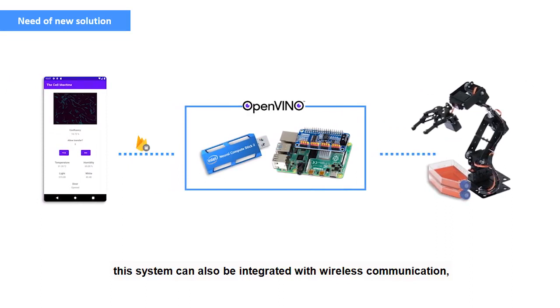Furthermore, these systems can also be integrated with wireless communication, allowing end users to remotely monitor the process through their mobile phones.